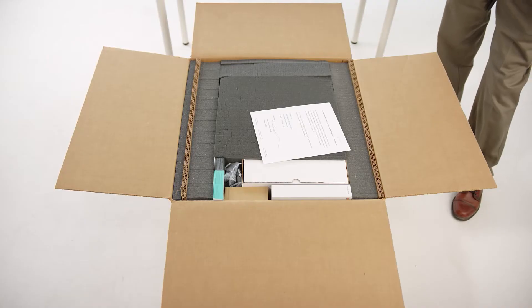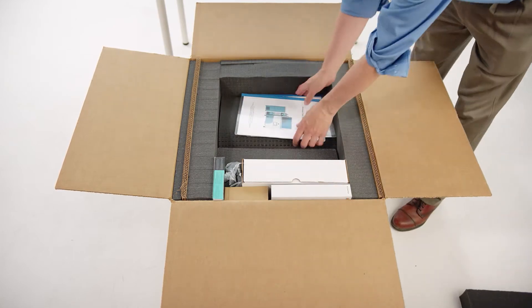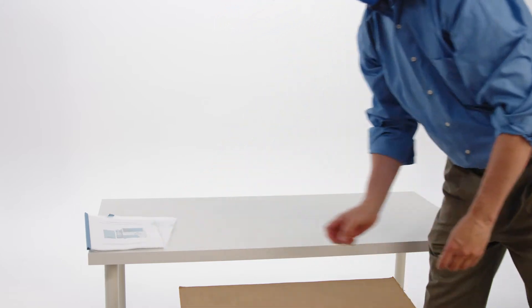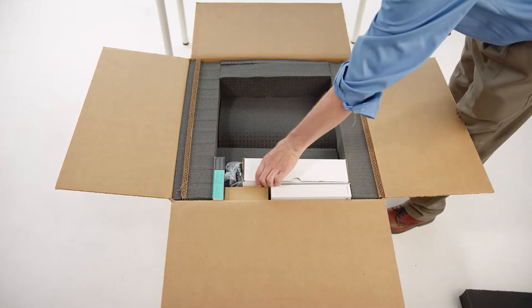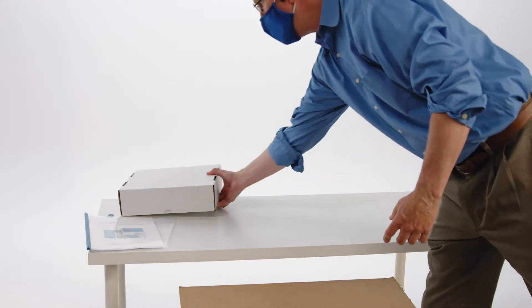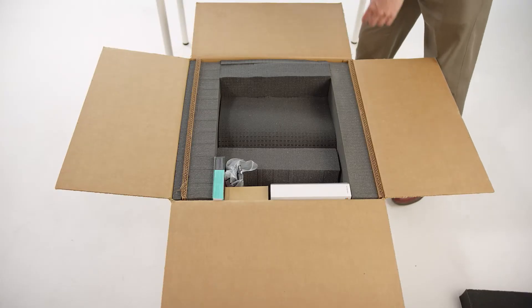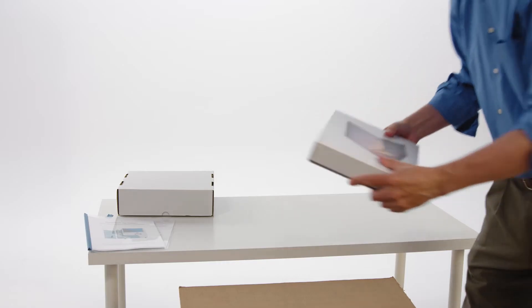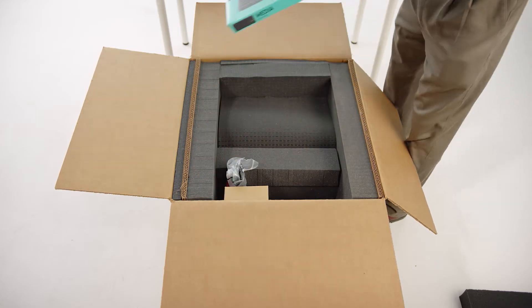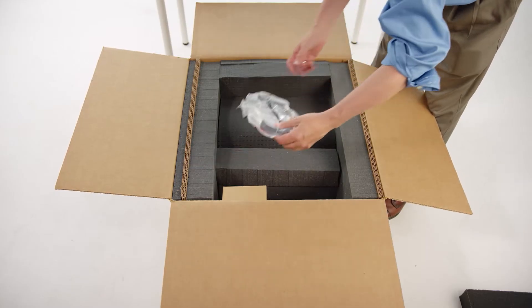Open the larger box number one and carefully remove each of the accessory boxes and components. These will include a Singulator 100 manual, an installation guide, a quick start guide, a box for accessories including six nuclei sample cartridges, four reagent bottle caps, a 250 milliliter bottle for waste, and a 250 milliliter bottle for water, both empty, a Microsoft Surface Pro tablet computer, a Bluetooth keyboard, and a power cord for the Singulator.